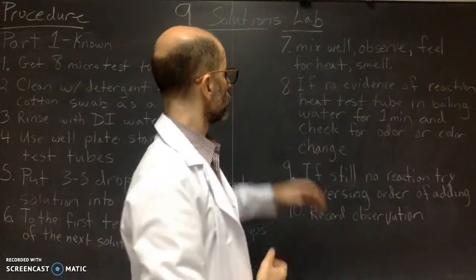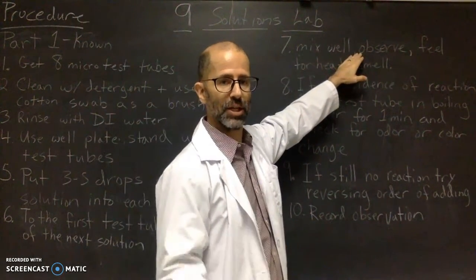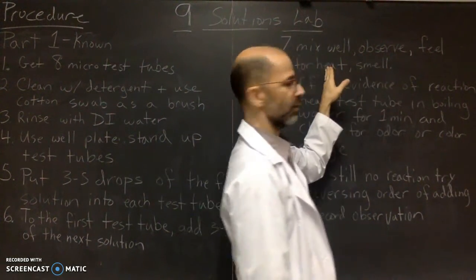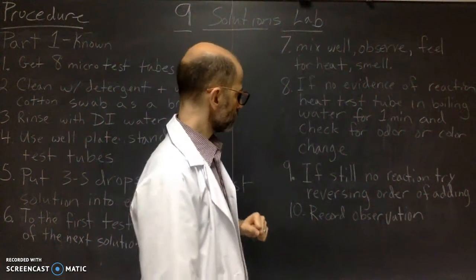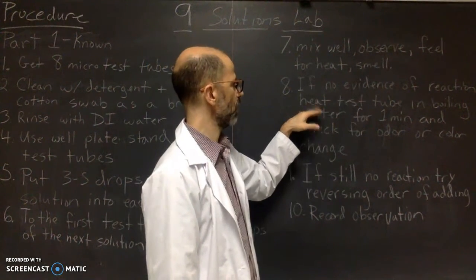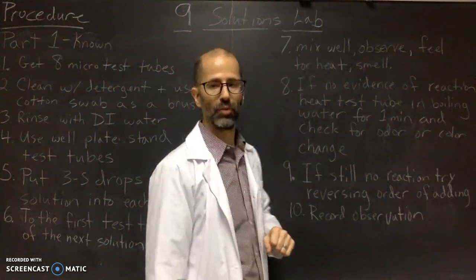All right, so you're observing color changes. Is there a precipitate? Is it cloudy? You're looking for heat, colder, hotter, smell, things like that. If you don't have any evidence of a reaction, heat the test tube up in boiling water.